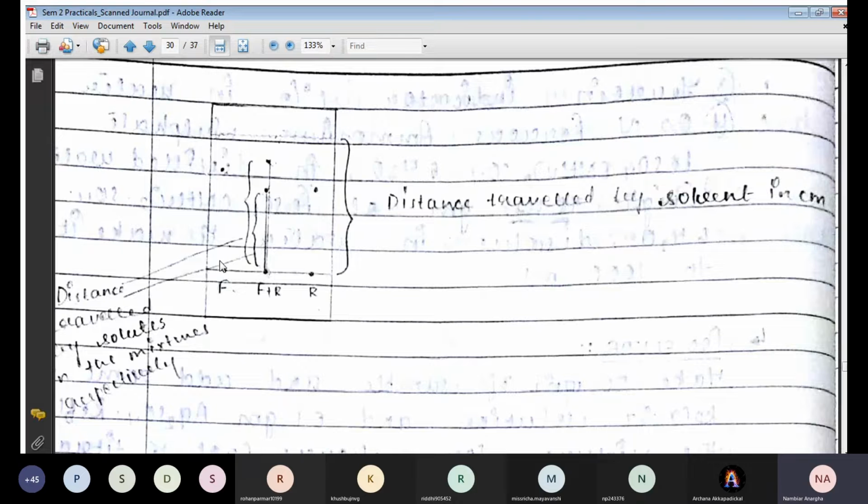This was just done at that time, as shown over here. So when we place fluorescein, where F is, the standard F, there we place a spot, and again we place a spot in the mixture area, that is F plus R. Once the spot is done, now we'll go with rhodamine. There will be a particular capillary for rhodamine. Again we'll take rhodamine, spot rhodamine, and then again that rhodamine sample will be spotted in the mixture.